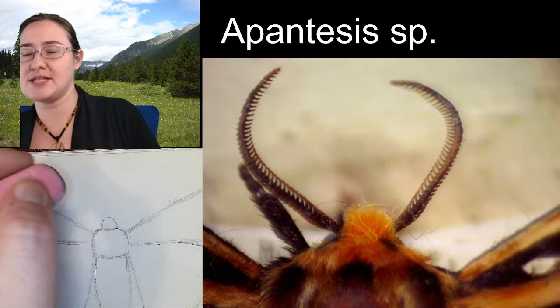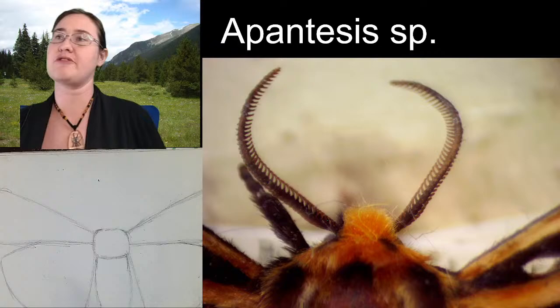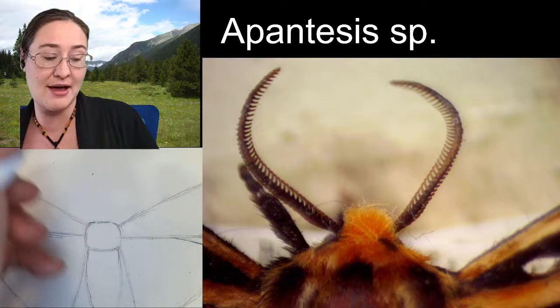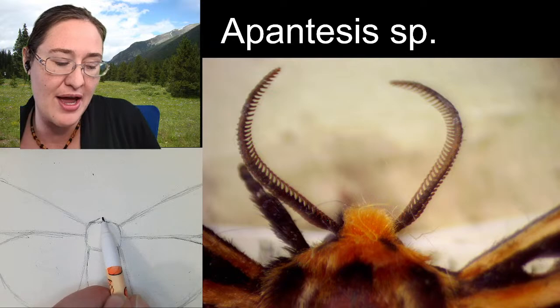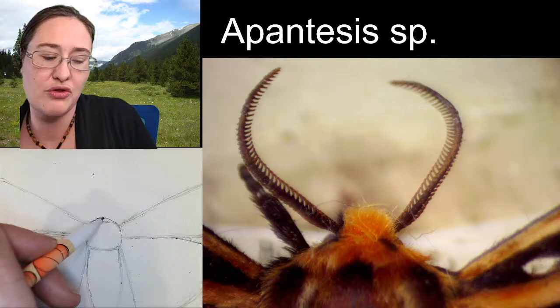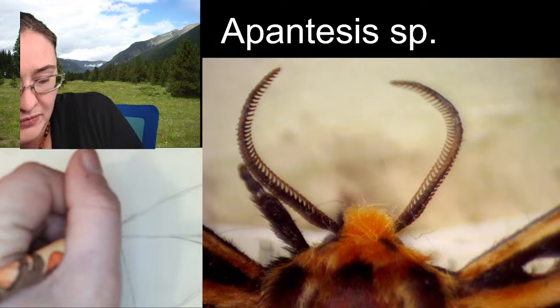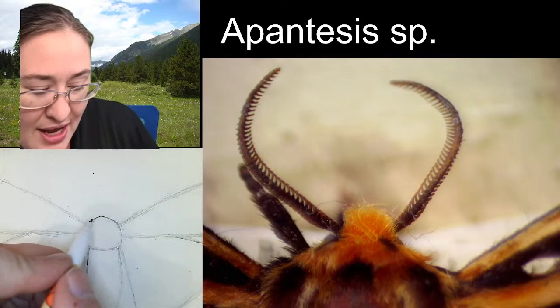So instead of it being such a pronounced head, I'm going to be kind of shortening the head here. I do want to add what we can see of the compound eyes, and that's not a whole lot. Before I add the compound eyes, I'm going to make this little bit of a mountain here on the thorax. So the thorax isn't shaped completely flat along the top. It has this little bit of an arch, and that's going to be where the head is connected. And the eyes you can see kind of on either side of this mountain.